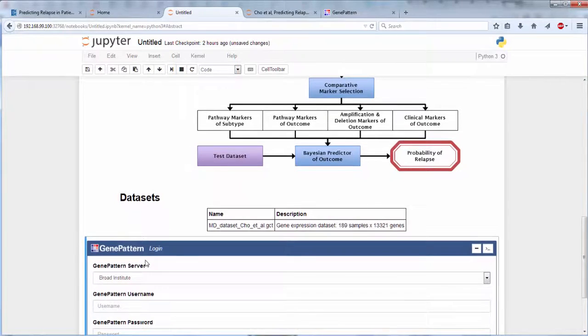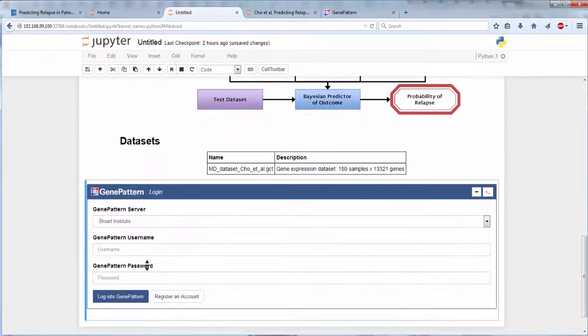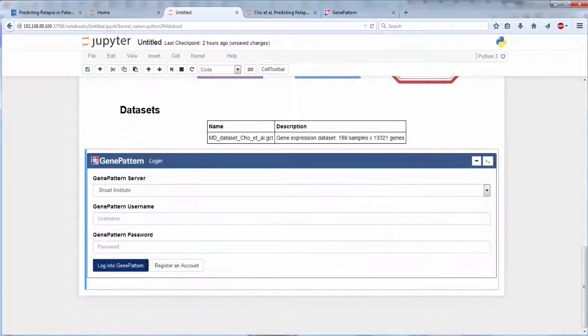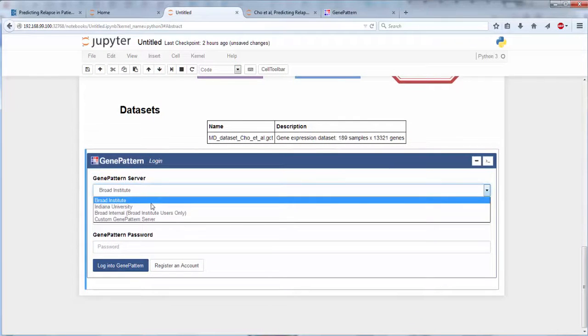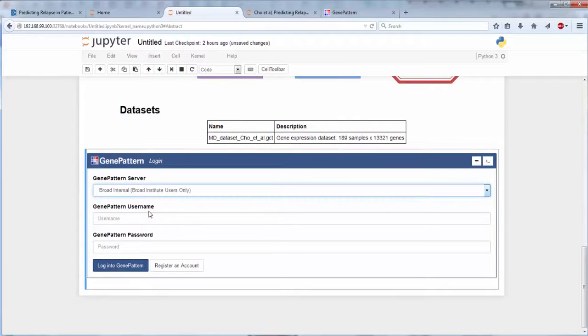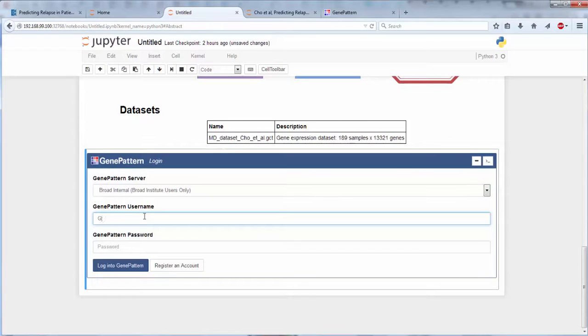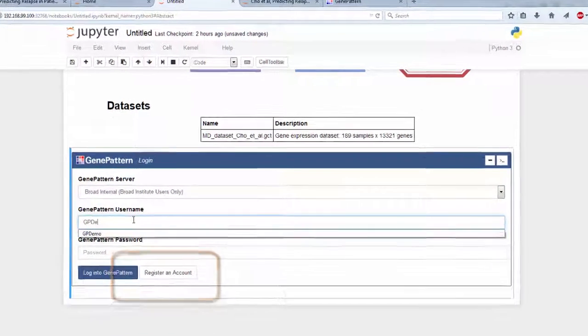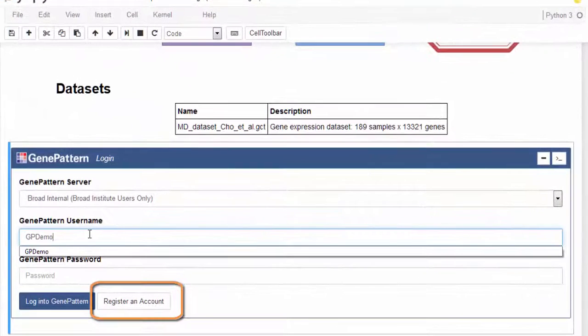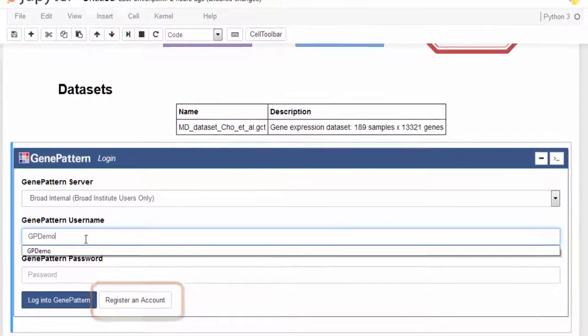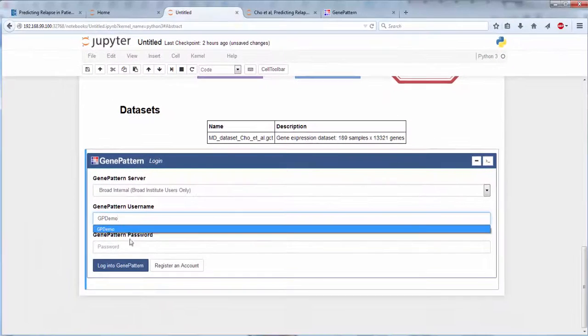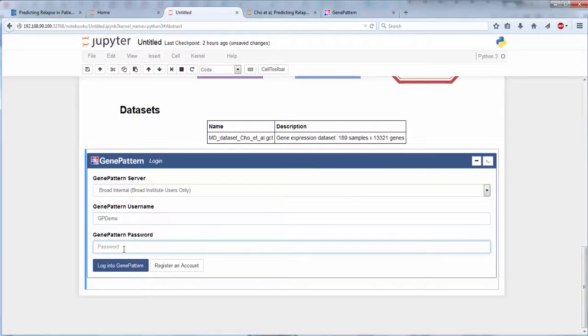Once inserted, the cell will prompt you to select an available GenePattern server and log in. If you do not have a GenePattern account, you can register from this cell as well. Note that all GenePattern servers are free to use.